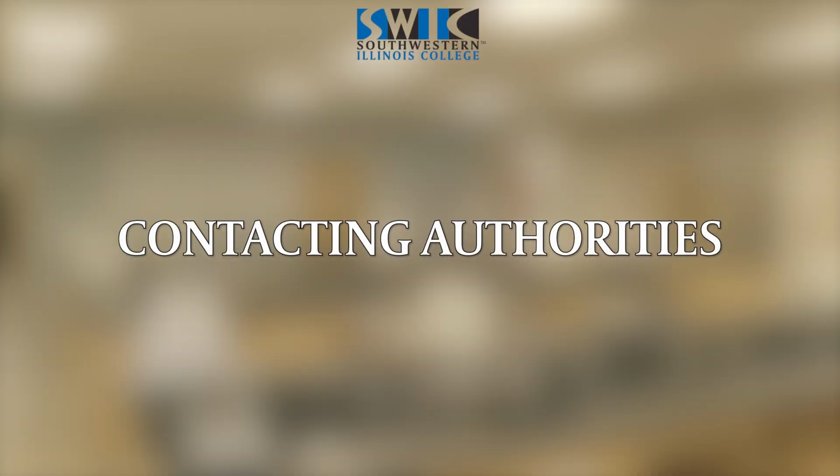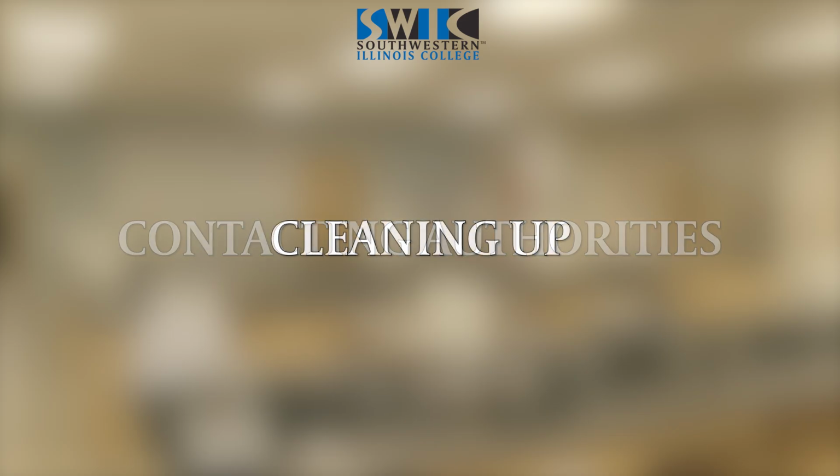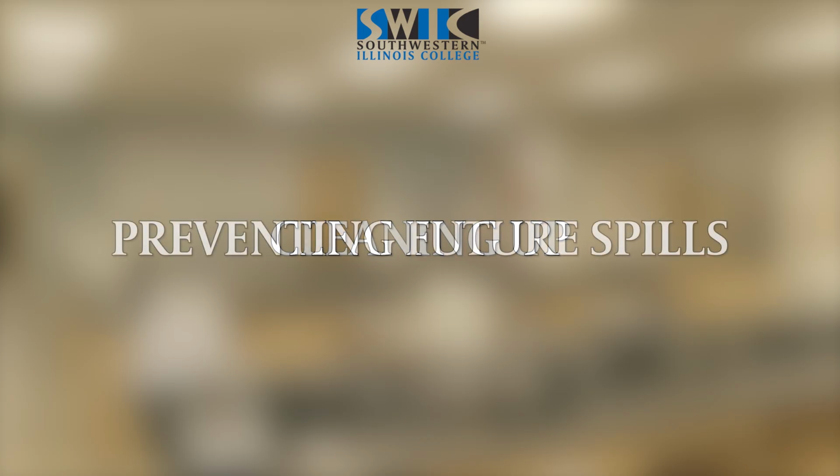Contact your lab manager or emergency services as required, and you should do this as soon as possible. After the spill is contained, dispose of waste materials safely according to your lab's guidelines, and make sure you follow all proper cleanup procedures. After the incident, it's better to be safe than sorry. Take the time to analyze what went wrong and think about how to prevent future spills.